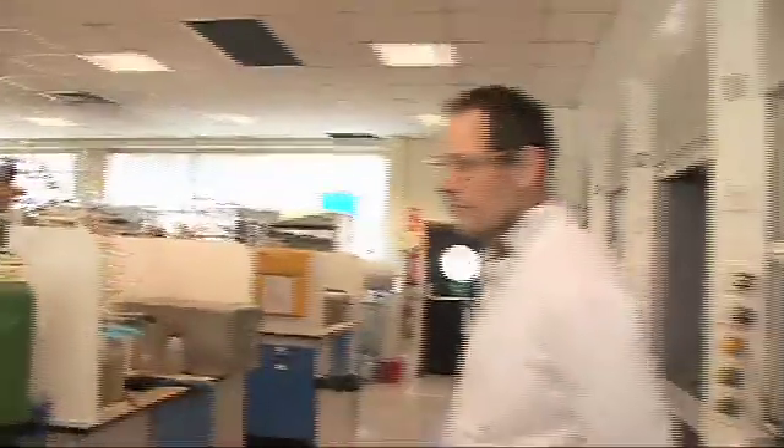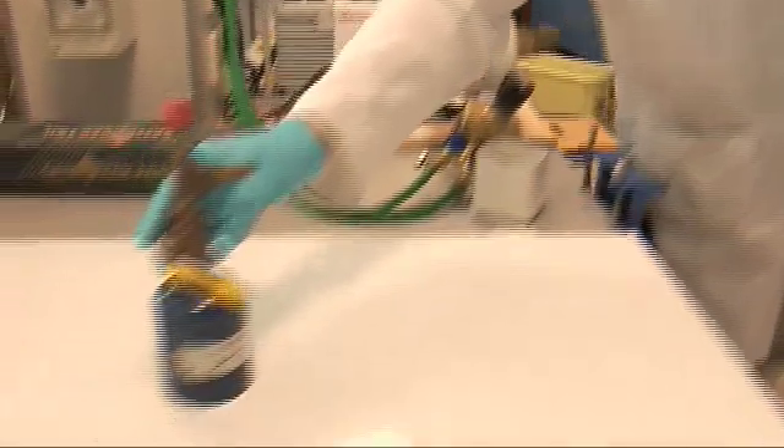Last time we tried diethyl zinc but it was a bit disappointing because it was in hexane, so it wasn't really free enough to kick off. But fortunately Professor Simon Woodward, a colleague of mine just over here, has been very kind and is going to let us use some neat diethyl zinc — really quite frisky, I'm told. So I'm hoping we'll get our blue flame this time.